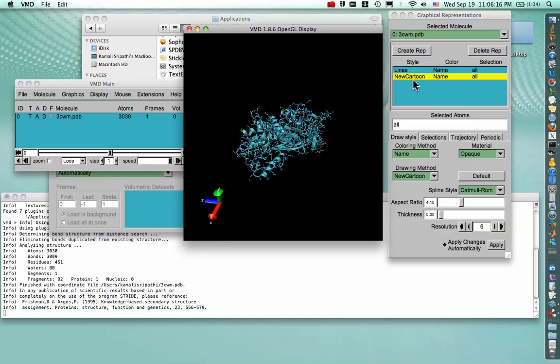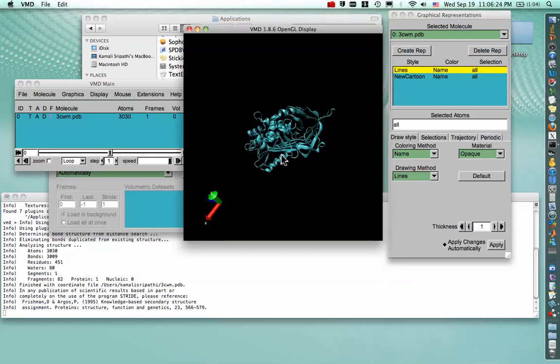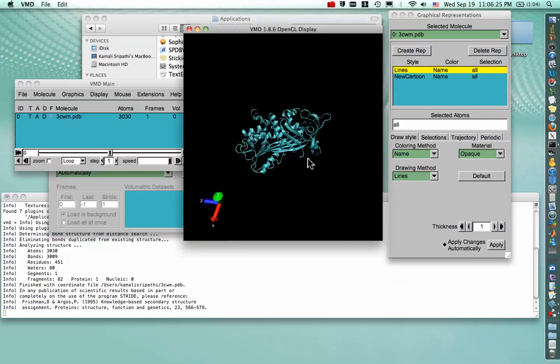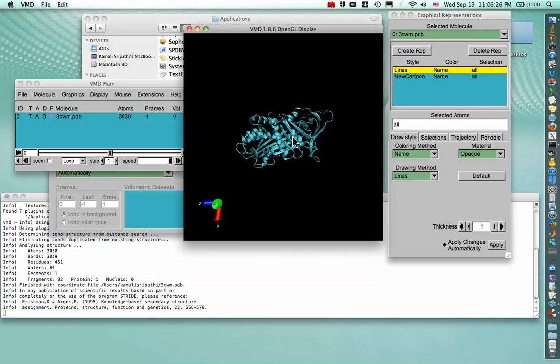And to hide the Line Representation, we go back to the Graphical Representations window and double-click on the Line Representation, and that disappears from our structure here.